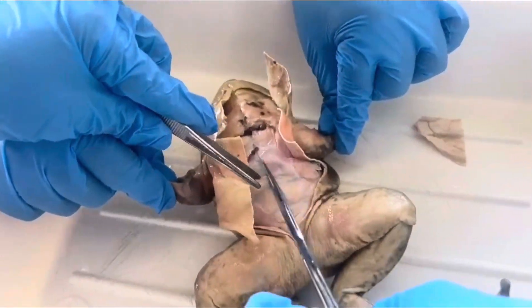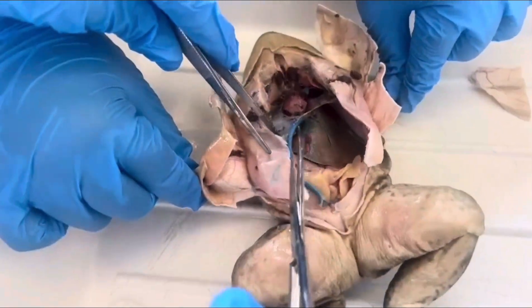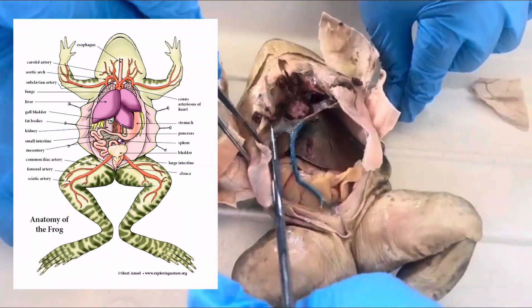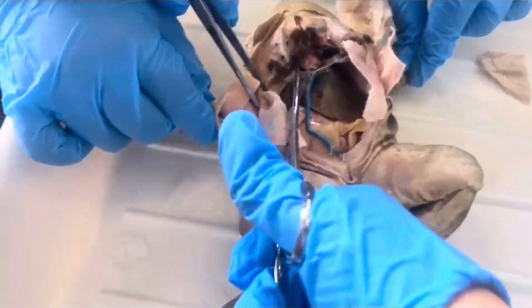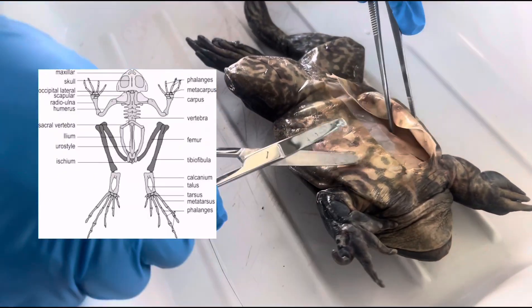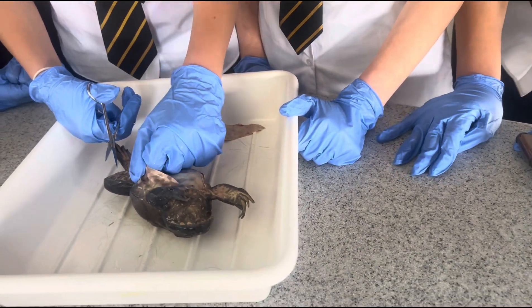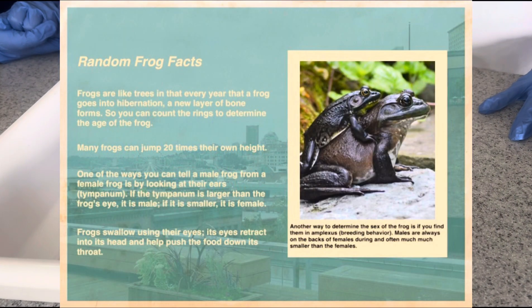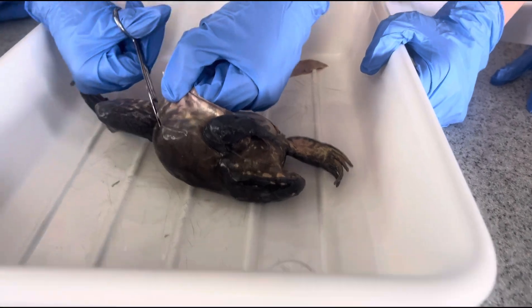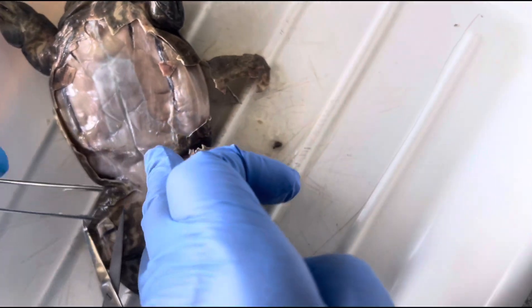I've already touched the frog now so I can't touch my phone. You can dismantle it — you can cut the thighs off, yeah, start taking all the organs out. Put it from the front first — you can do that. Look at that sir, I've got a wee ball! The legs are amazing — if you cut the leg off there are rings around it that shows you the age of the frog. You can eat frog legs. So make a little snip in there and then go all the way down.